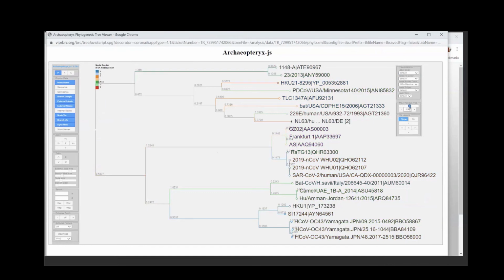So this one goes sliding through the multiple sequence alignment, and it shows you the amino acid at any given position. So you see certain positions have a lot of different amino acids, or certain other positions only very limited ones. So that's pretty much it.